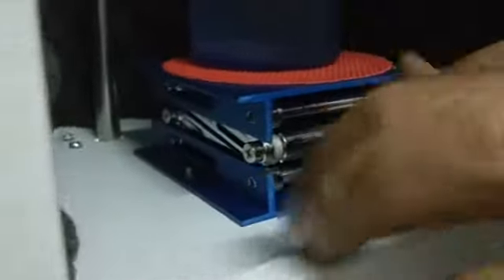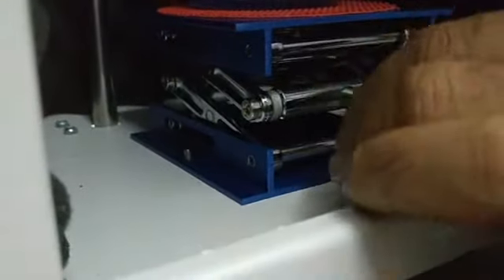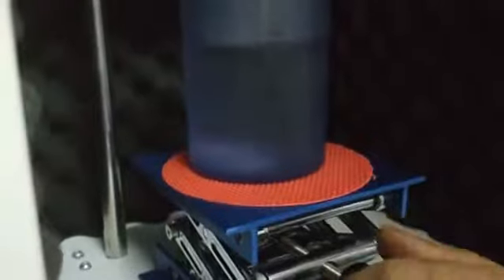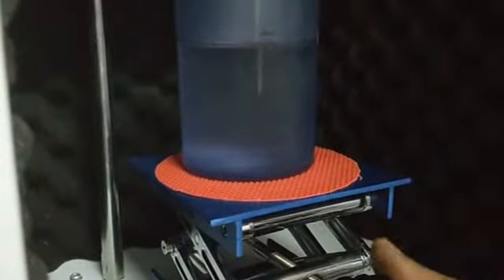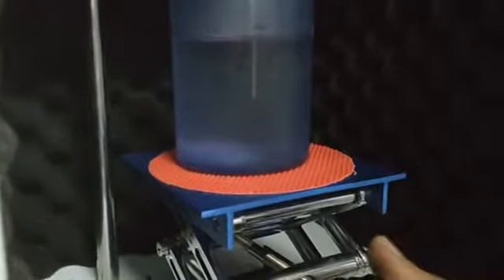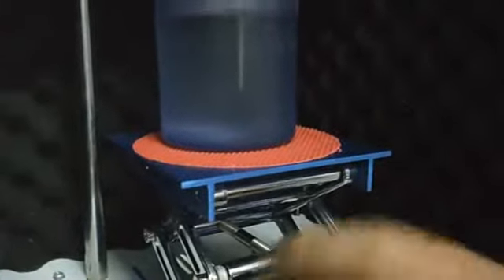In that case, we will simply put our sample, say this type of beaker or glass, and we can adjust the height of the platform with this nut. Make sure that in any case, the tip of the probe should be inside the solvent at least 1.5 to 2 centimeters. It may be more, but at least it should be 1.5 to 2 centimeters.